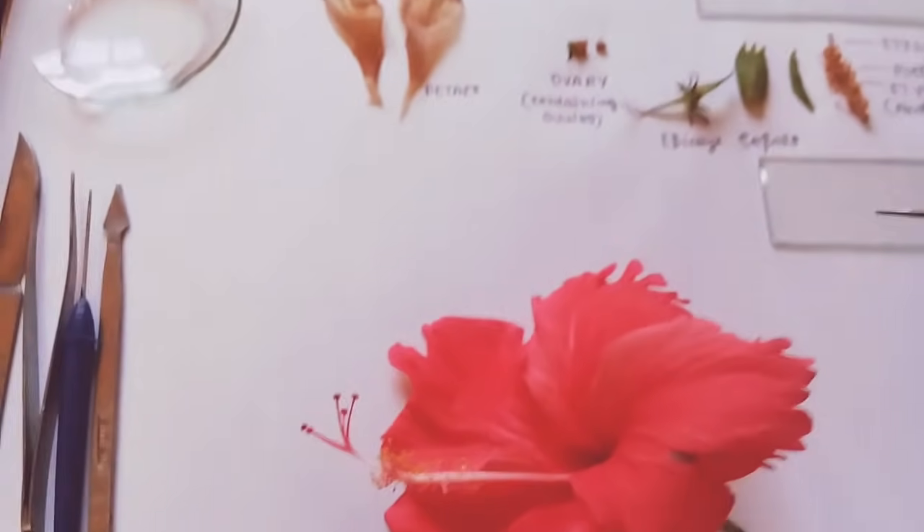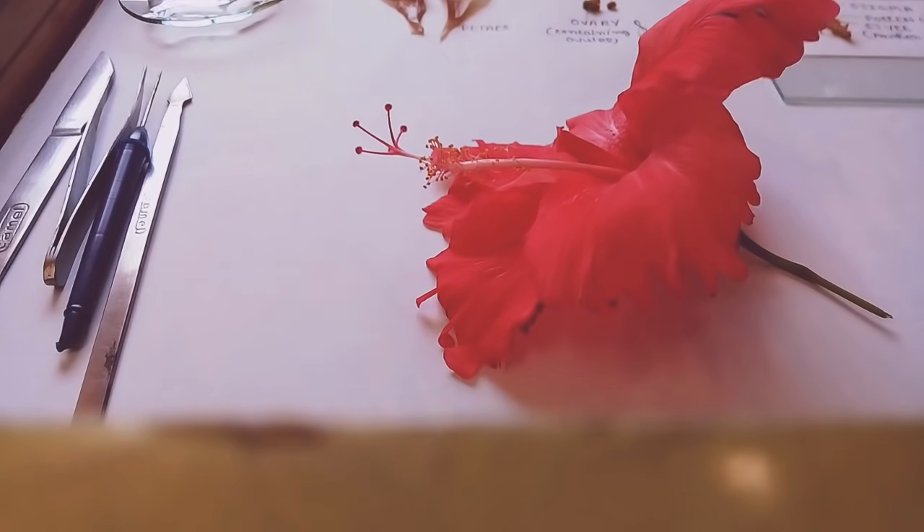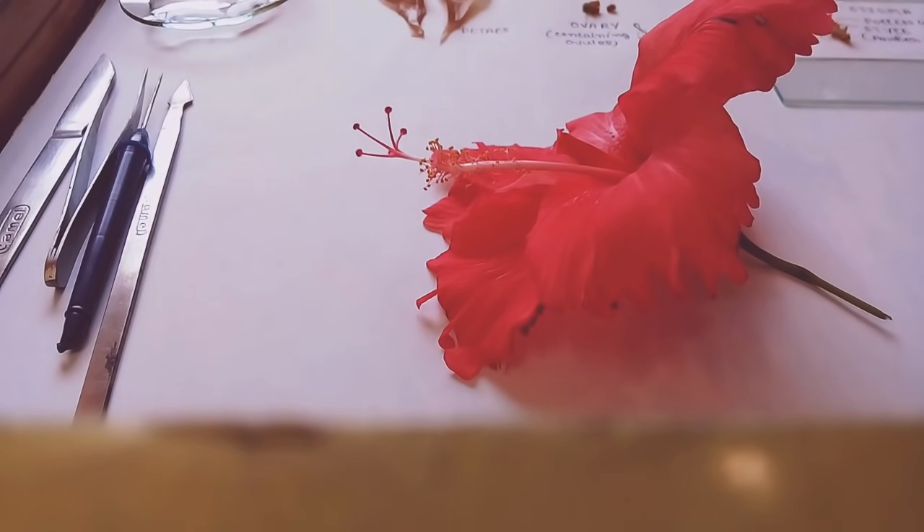Hibiscus rosa-sinensis — the plant has got adventitious roots and it has stipules. It has an ovate type of lamina, reticulate venation, and alternate phyllotaxis. It is an actinomorphic flower, it is monodelphous, has axile placentation, and it also has many medicinal uses. So without any more delay, let's begin.